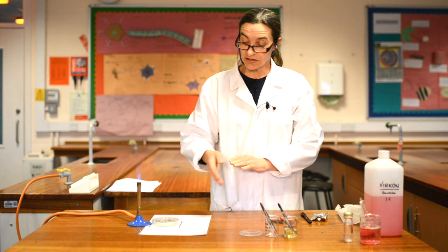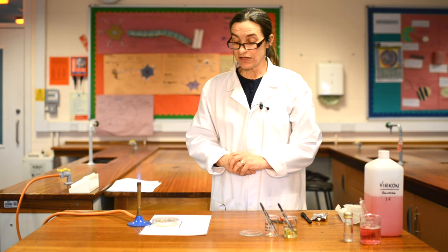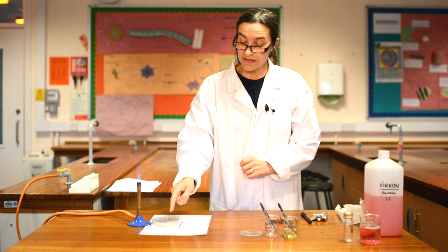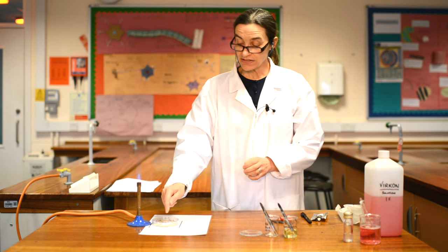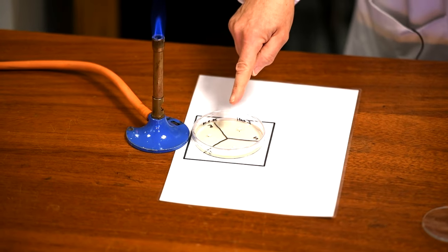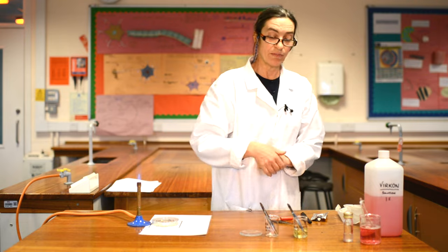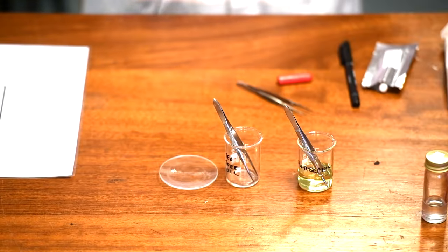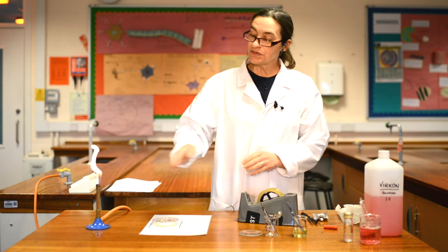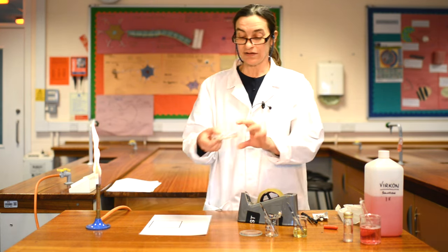We need to incubate that. It's got to be incubated for long enough for the bacteria to grow, but not so long that the whole thing is completely covered and just looks generally unpleasant. What we want to see is whether these discs will kill the bacteria. We'll know they've killed the bacteria if we have a clear ring around the discs. Now I'm going to turn this Bunsen back to yellow and push it away — we don't need blue flame anymore because our bacteria are now sealed in the agar plate.